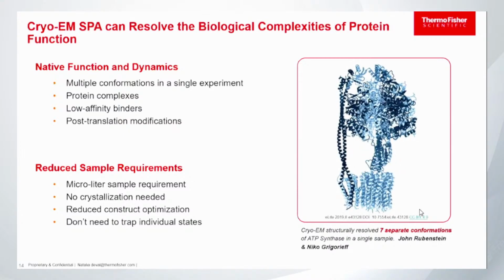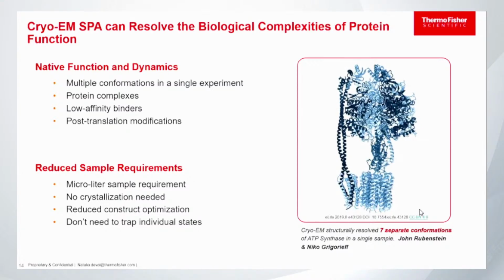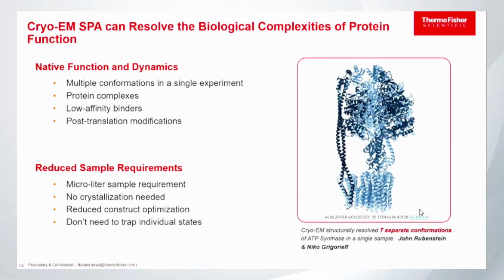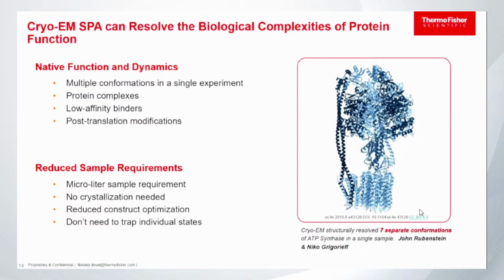You can work as well with protein complexes. Again, the more complex or the more proteins you want to crystallize in the same experiment, the more heterogeneity you are adding into your system, the more complicated it's going to be to have a crystal, okay?